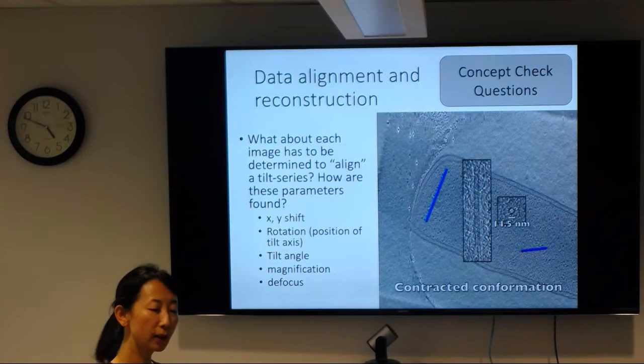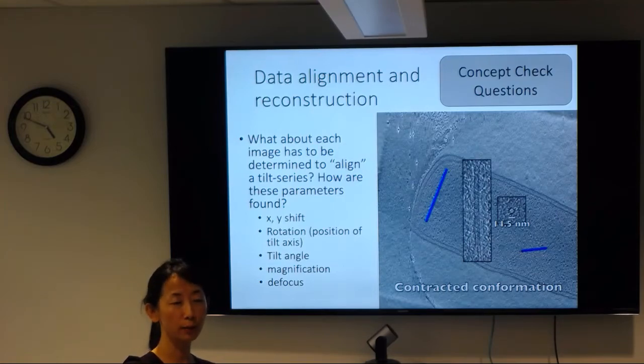To be honest, because the orientations of the two tubes are not really parallel in XY orientation, by looking at the section slice views, if we don't have that polarization marker, your confidence level will really be low. Finding those two tubes and naming them the type 6 secretion system. So I think this is a very, very good paper and a very good project. And I'm really impressed they were able to carry it all the way from beginning to end.